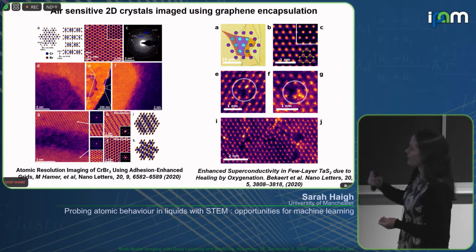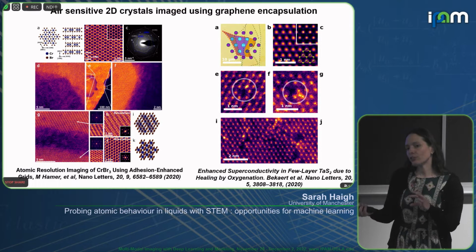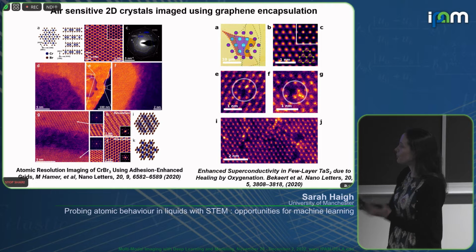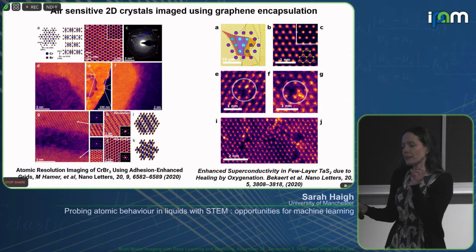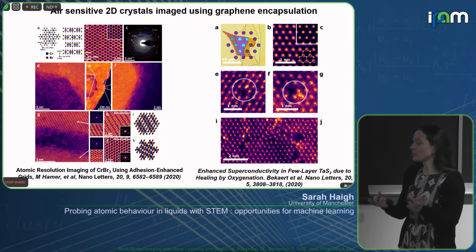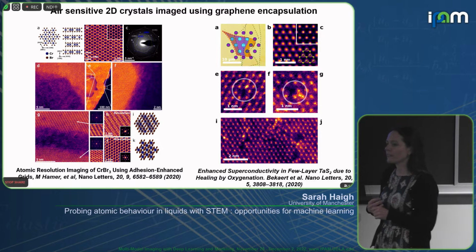I'd be happy to talk to you about this. This one particularly, we did some EELS analysis on the degradation structure and found that the oxygen, which is part of the trapped species that is within the layer and is able to diffuse inside, exists in both a crystalline form and an amorphous form using principal component analysis. And so the fact that you have these two forms tells you that there's not just rubbish trapped between the two layers that are encapsulating your two-dimensional material, that oxygen is actually being incorporated into the lattice.